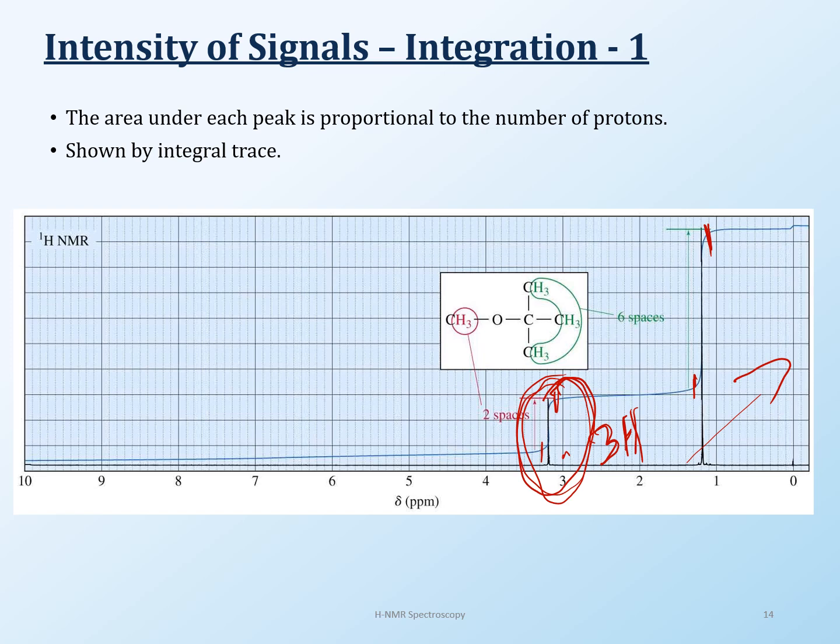If you're doing some kind of synthesis, you know what you're making. The problem is when you have an unknown compound and you just don't know how many hydrogens there are. In that case, you work a little on your analysis and then come back, and you can always do integration later. But one proton, or one peak I should say, you have to assign and say, okay, this one has 1 proton or 2 protons. That's how the calculation works for integration.